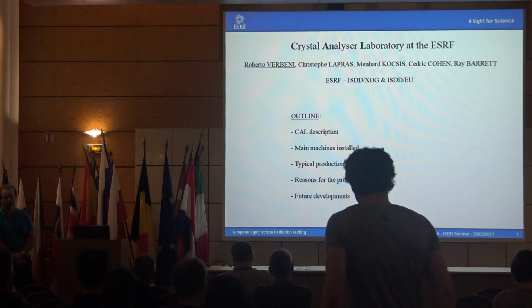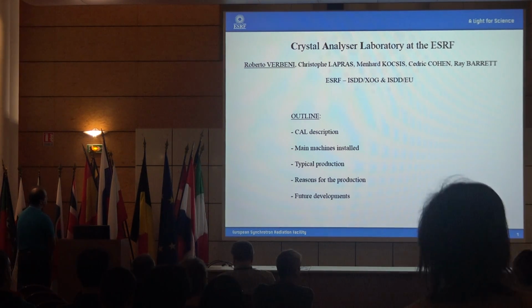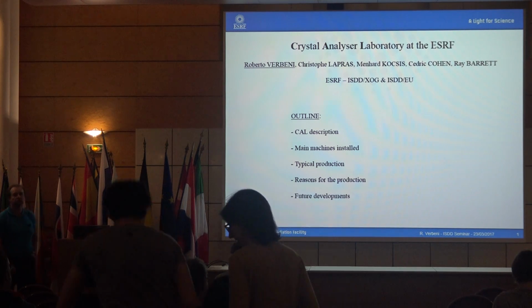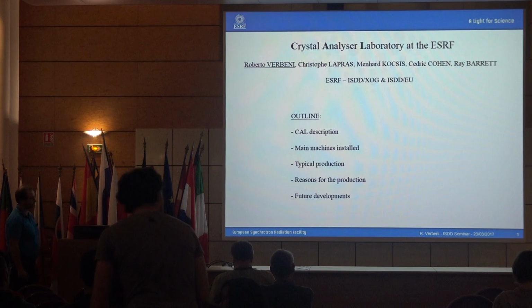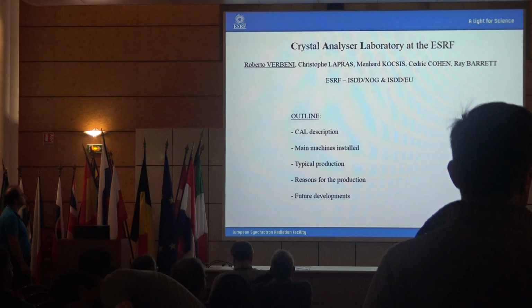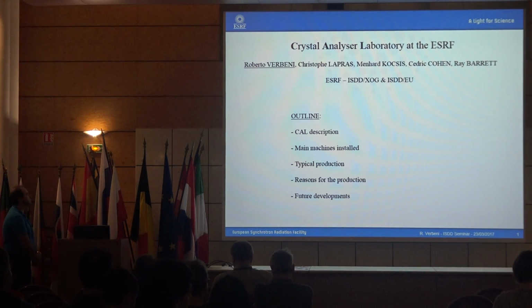Just a couple of words: we have been witnessing an explosion of inelastic X-ray and not only neutron scattering beamlines. It's important because this is good news for Roberto and his lab, because he's producing the crystal analyzers which are needed for these purposes.